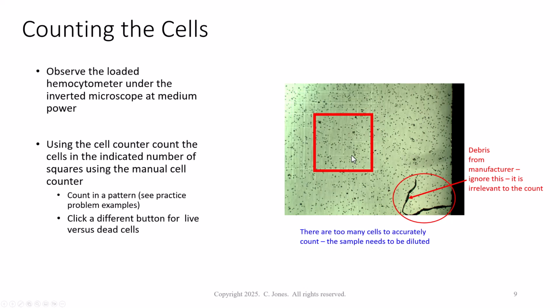And I guess maybe the other thing that we notice is there are some clumps of cells here, and we'll talk about that on the next slide.